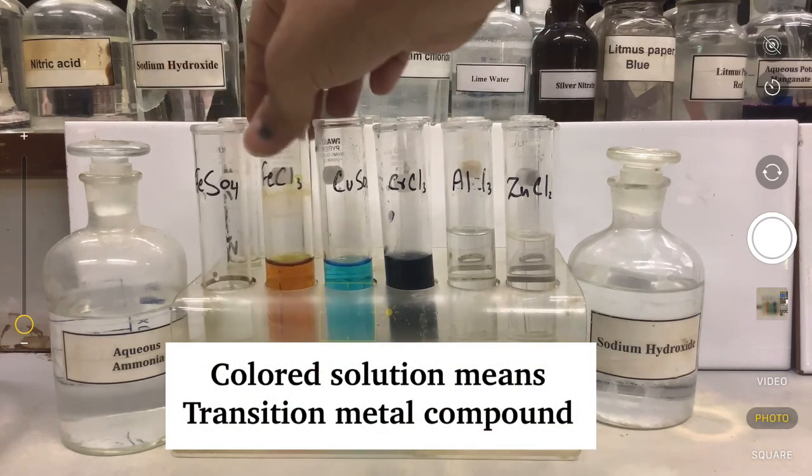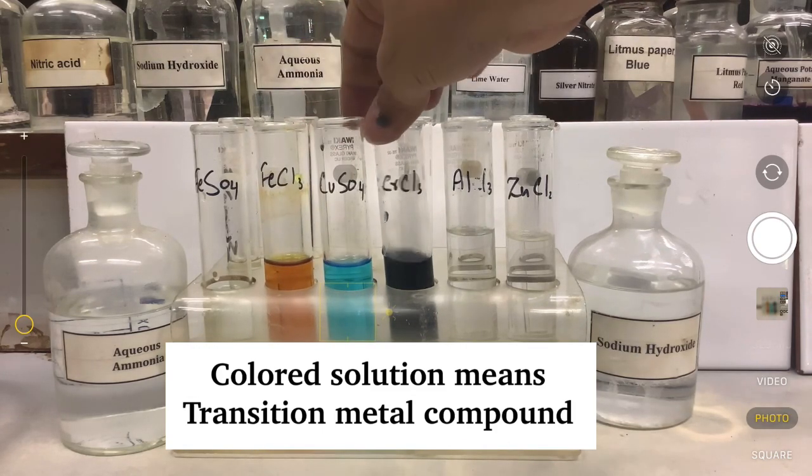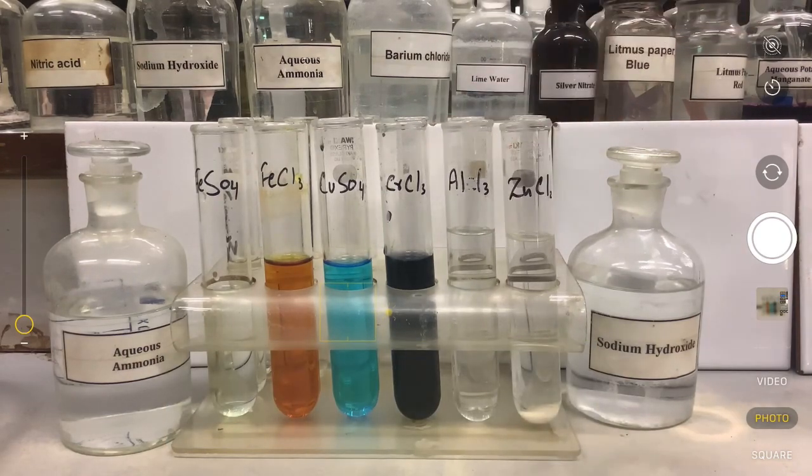If the solutions are colored, it means they contain a transition metal compound like copper 2, iron 3, chromium 3. If they are colorless, the general assumption is they do not contain a transition metal compound.